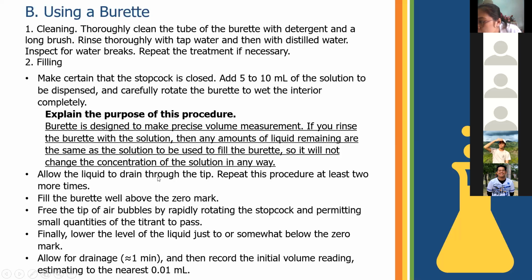So if you rinse the burette with the solution, then any amounts of liquid remaining inside are the same as the solution to be used to fill the burette. So it will not change the concentration of the solution in any way.